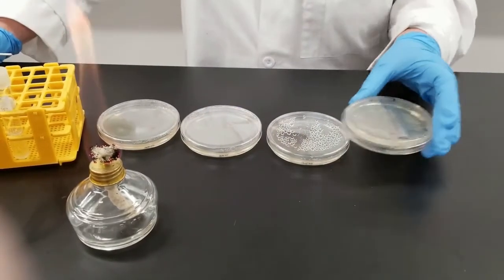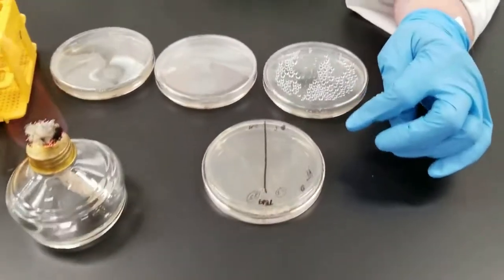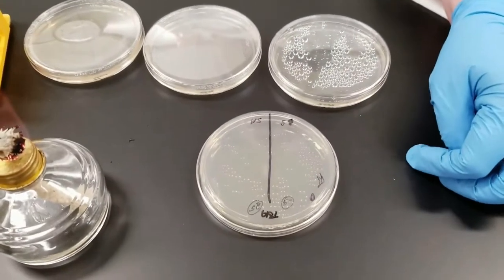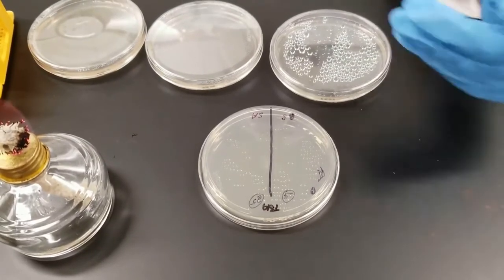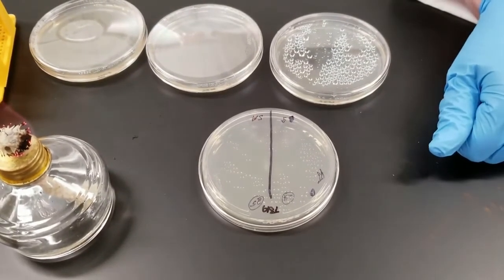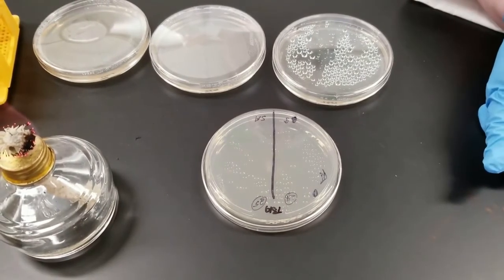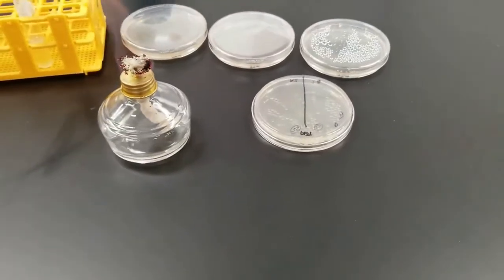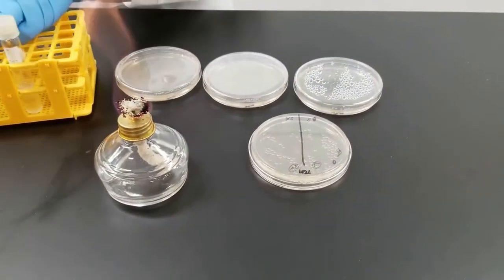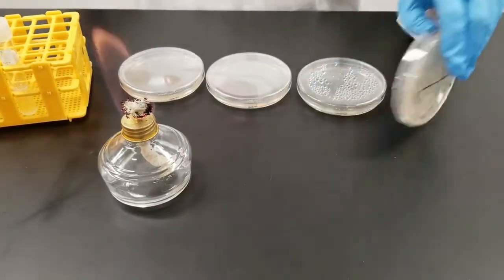The plates, I've left this plate upside down so that you can see half the plate. I'm just going to do a streak of Bacillus subtilis, and on the other side of this line, do a streak of Staphylococcus aureus, so we can compare easily, after we incubate them, the growth and the effect of the UV light on one organism as compared to the other organism, and compare the length of time. So we're just going to do a simple streak, not an isolation streak.